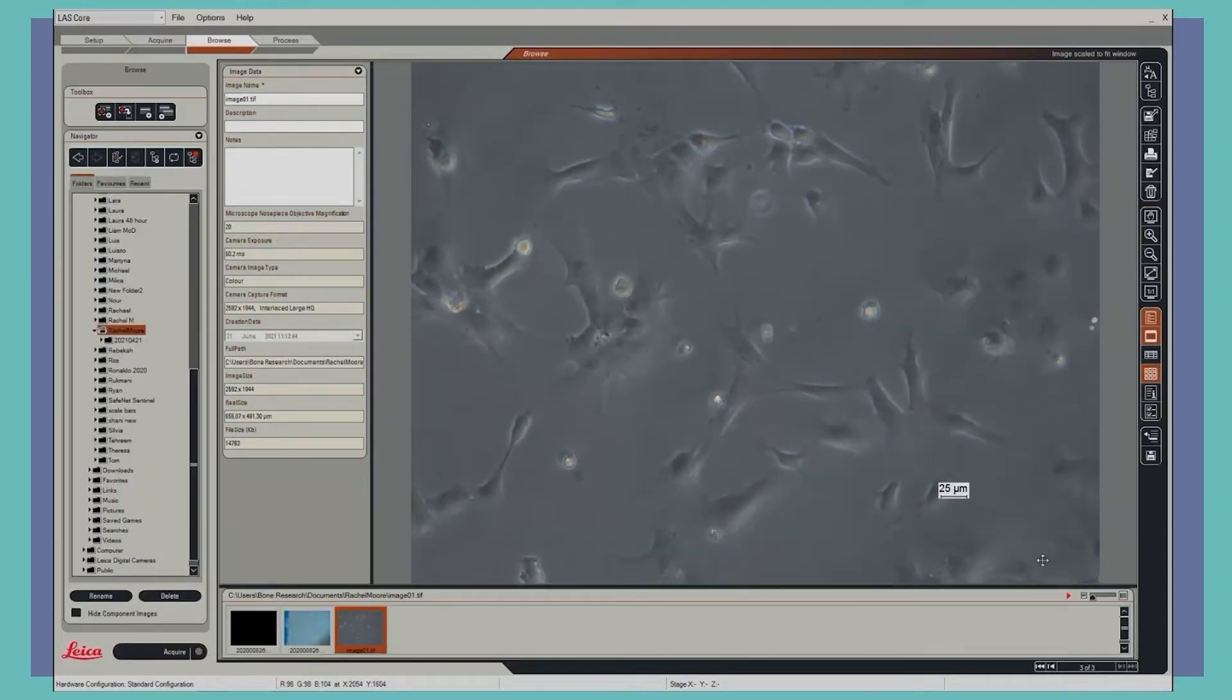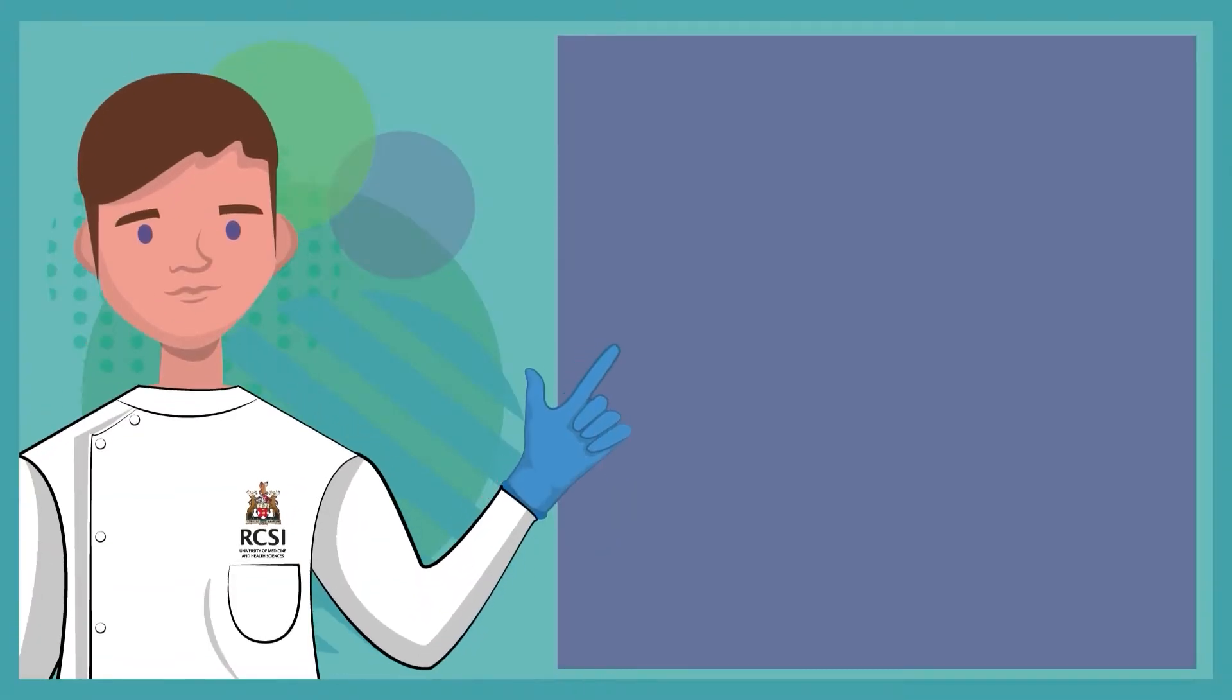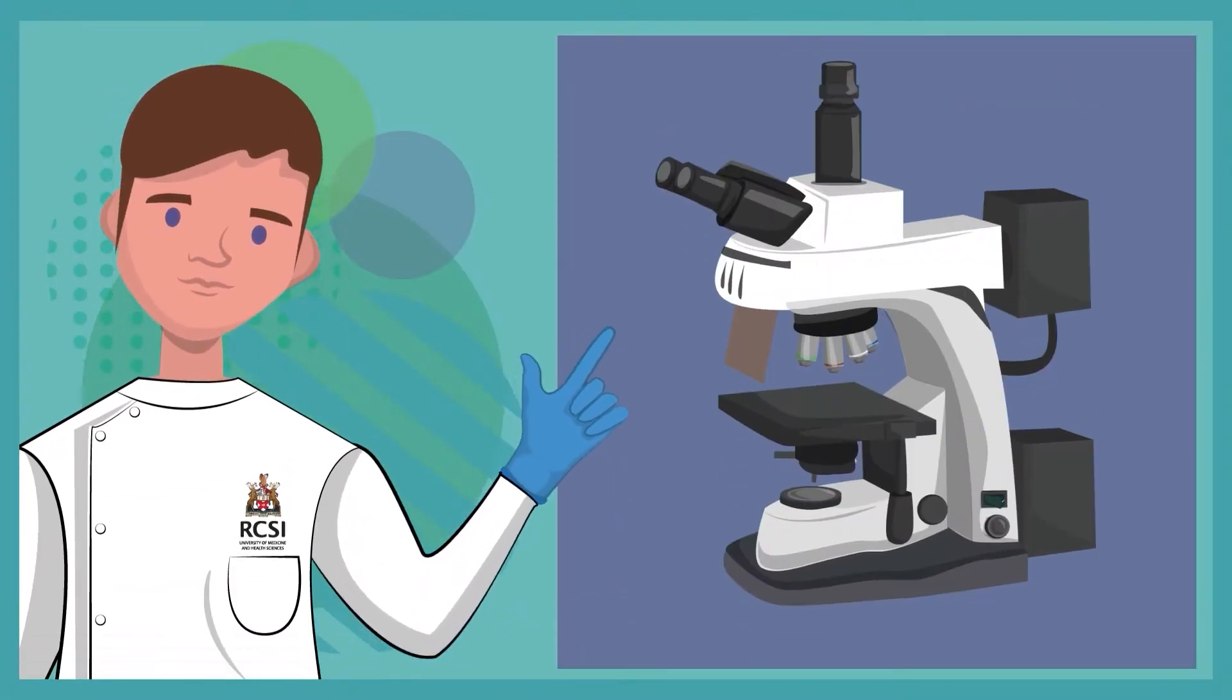Additionally, once you've acquired your image, you can also add a scale bar to help figure out what size of magnification you've acquired your image at. Next we'll be discussing how to use a fluorescent microscope.